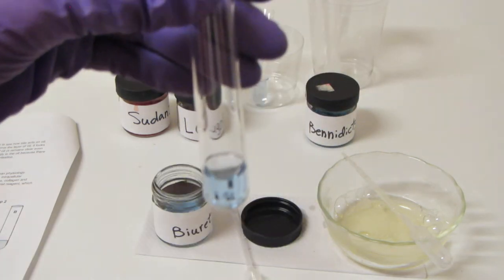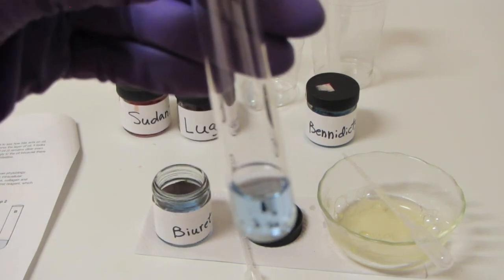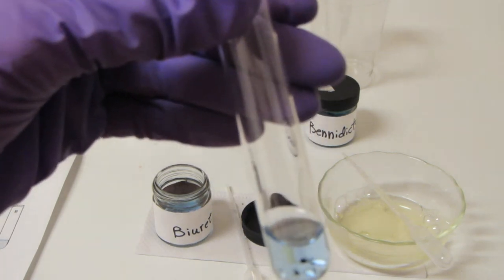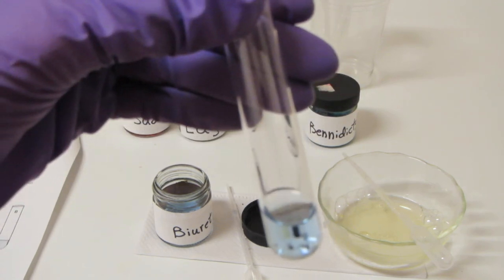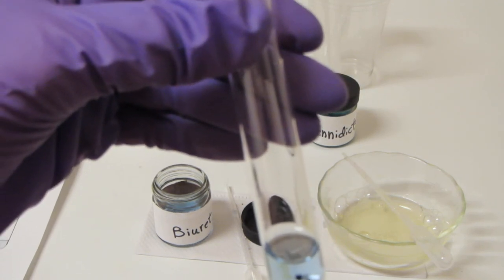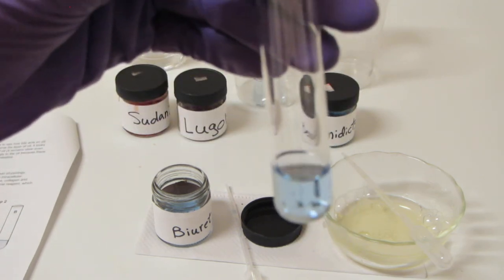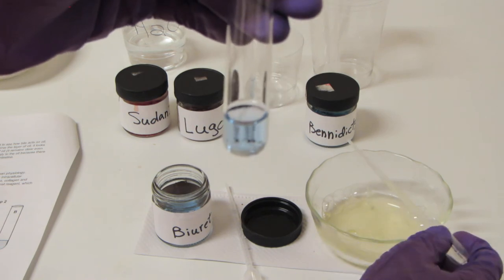So the easiest way to add protein to the solution is to use a protein which is already in liquid form. Easiest one I can think of to get my hands on is egg white. Remember, egg white is mostly a liquid protein called albumin. So let's go ahead and take some egg white. I cracked an egg earlier. That's what's in this container here.